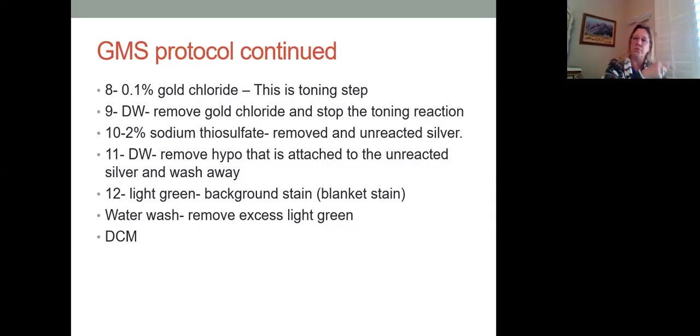Meaning you've gone too far, you've reduced it too far, and subsequently it won't withstand the rest of your stain process because you have actually detached the aldehyde. So you're done at that point. You have to start the whole stain over.